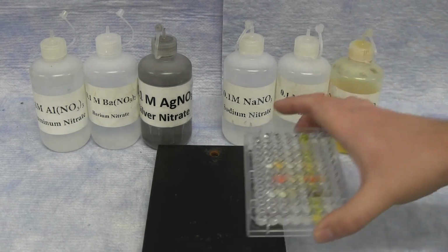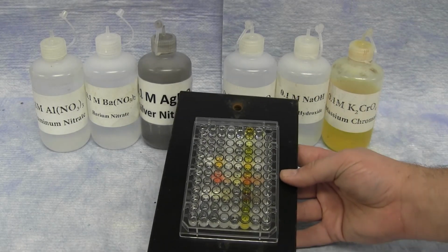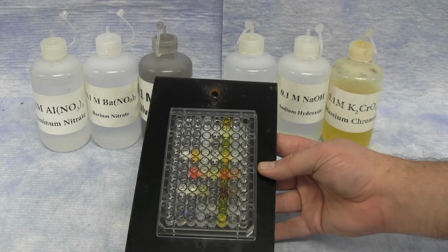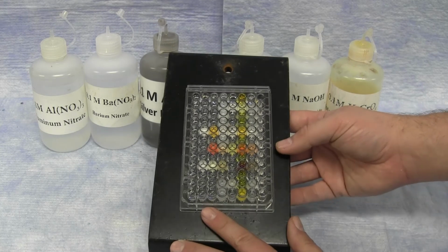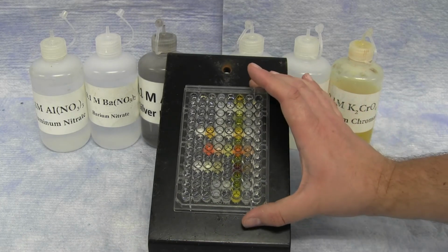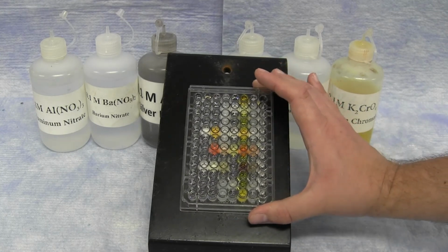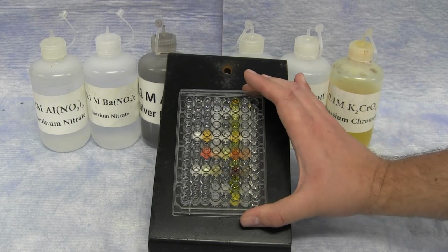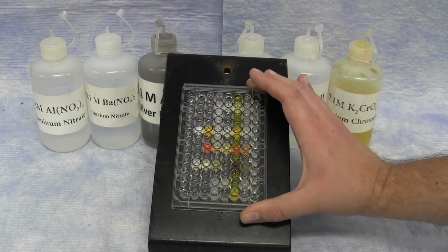In the end, the 96 well plate would look something like this, where you have a number of different precipitates in multiple different wells. Some have different colors, others do not. Many of them are white precipitates, so you may want to have this on a black background so you can see the precipitates more clearly.